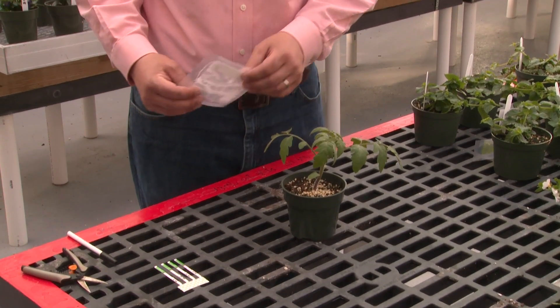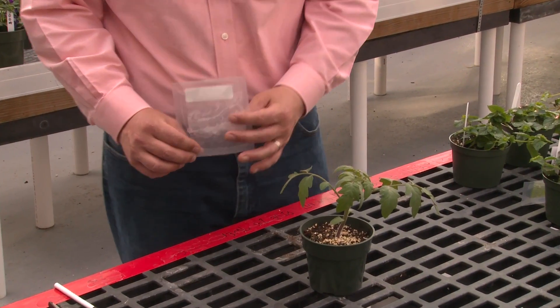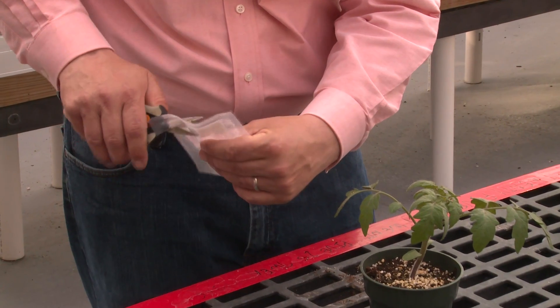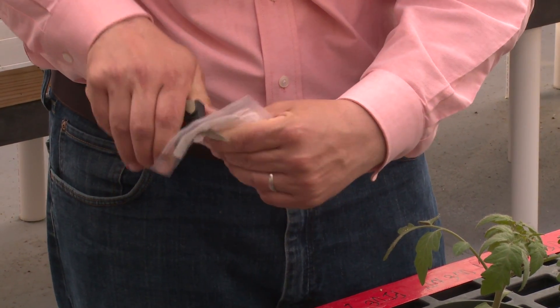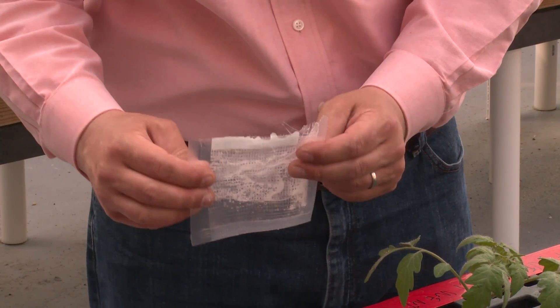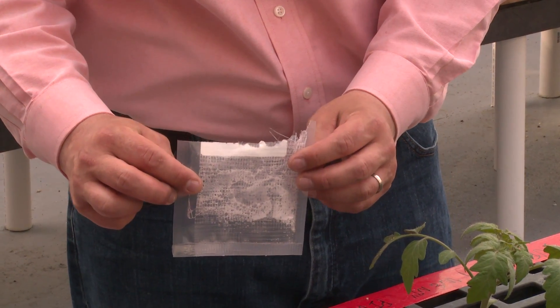First we want to take our strip kit with the buffer solution. We want to go ahead and open up this package. Once you have your package open, be careful not to spill out the buffer that's inside the package.